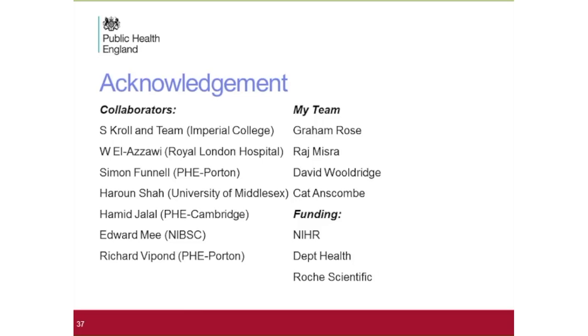Okay. So one of the questions was, what kind of standard did you use to actually compare all of them? An internal standard? We have added to it a known number. We added a Fusobacterium and an Enterobacteriaceae and E. coli, known and quantified genomic sequence, and we added cells from both of them. So we used 4 standards in each one.